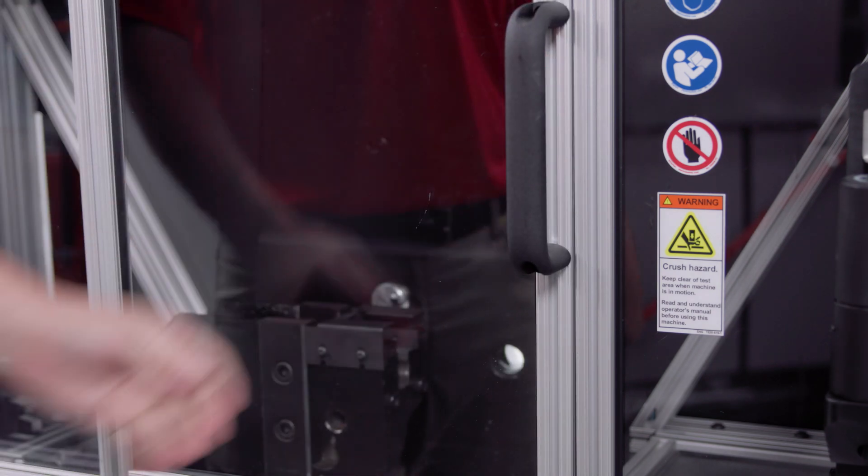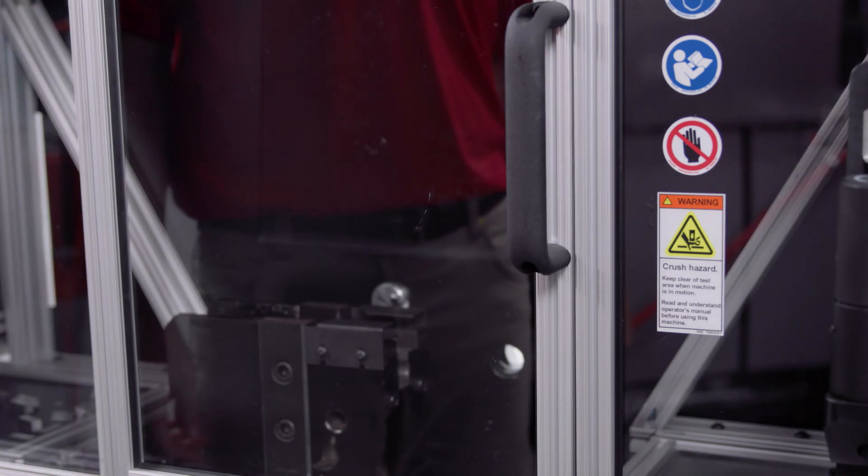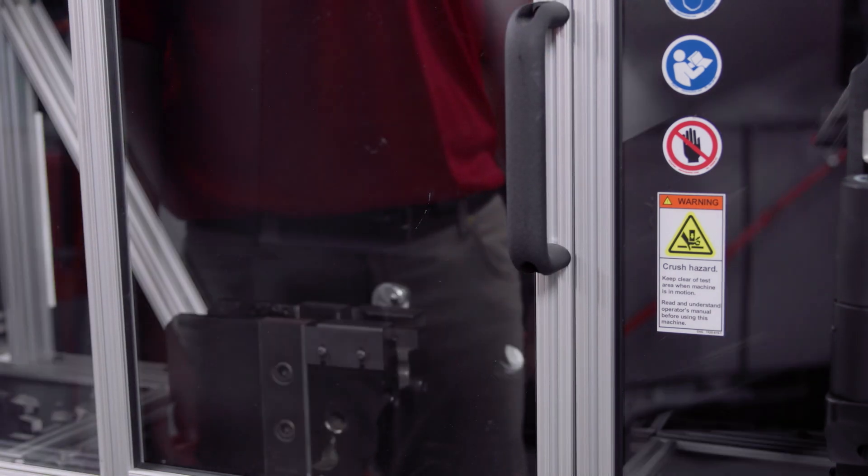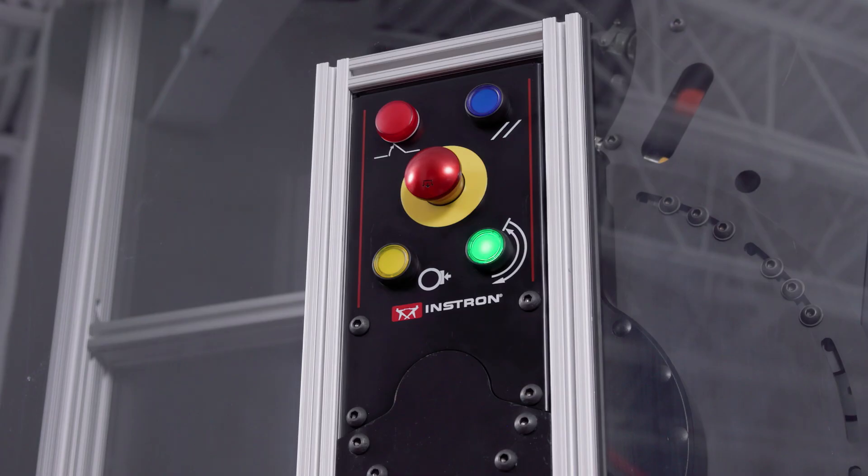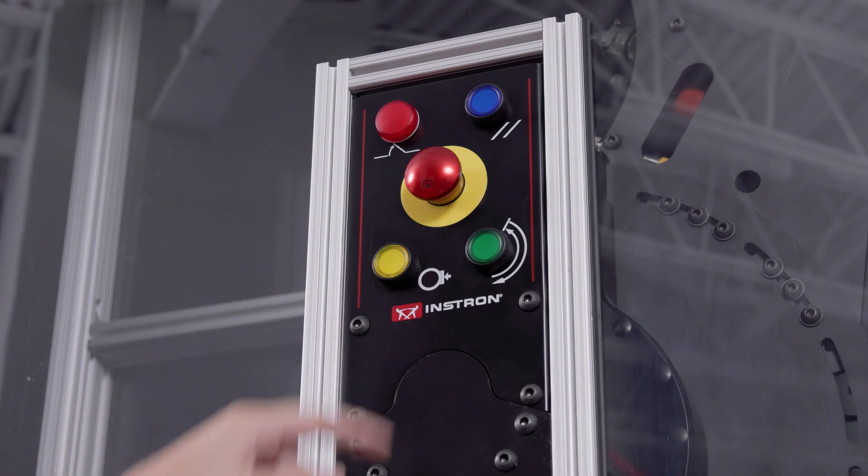This feature will stay active until you take a break in testing, or it can be disengaged by simply pressing the yellow button.